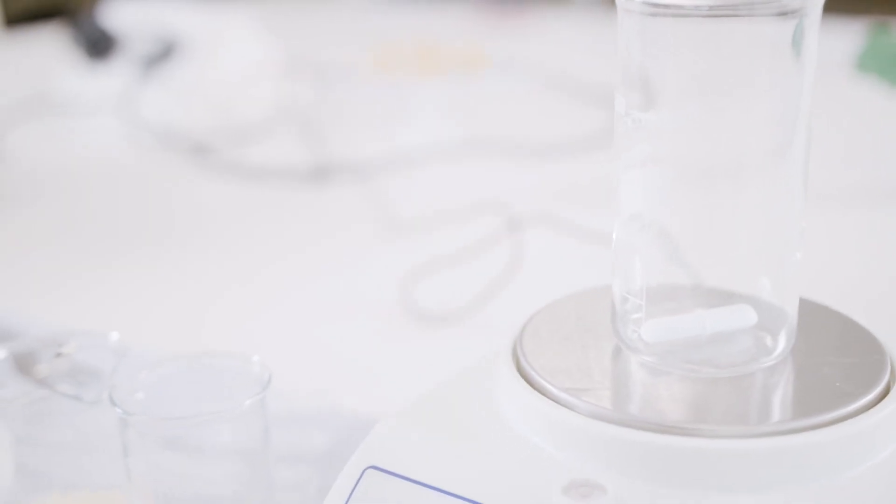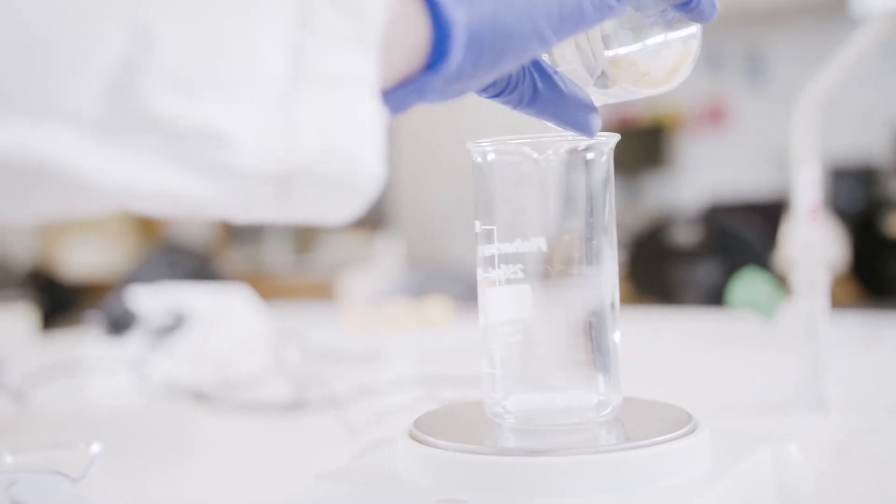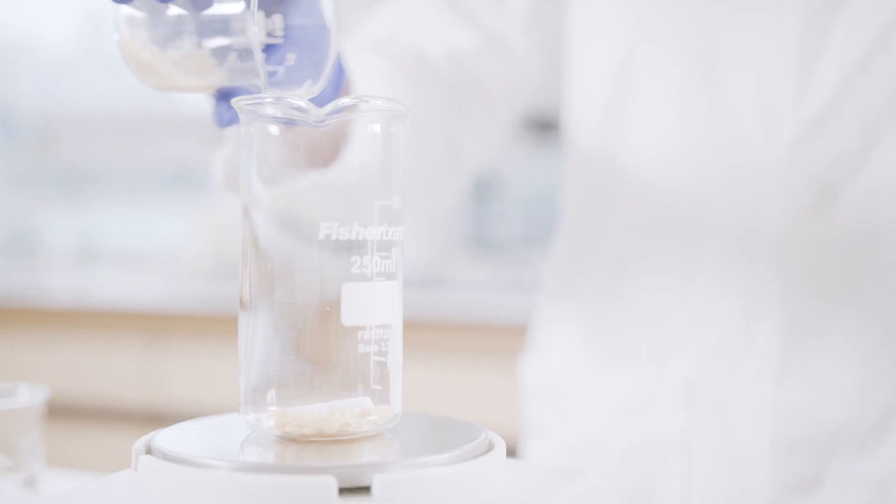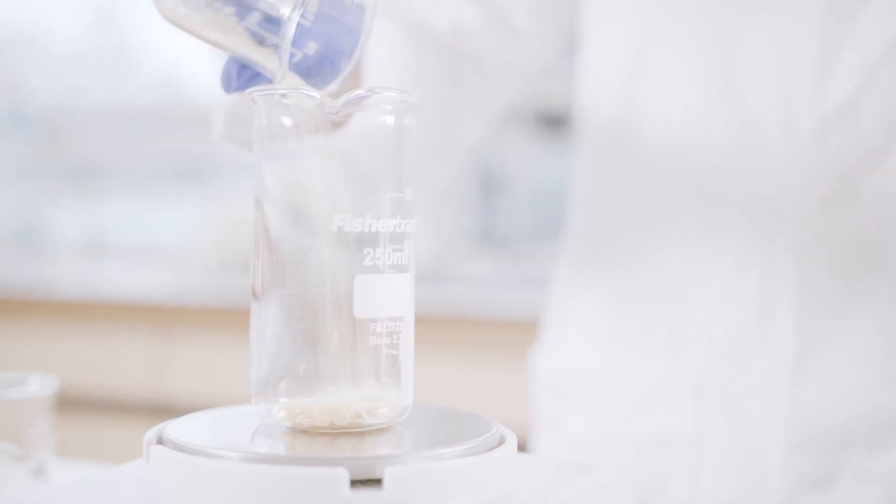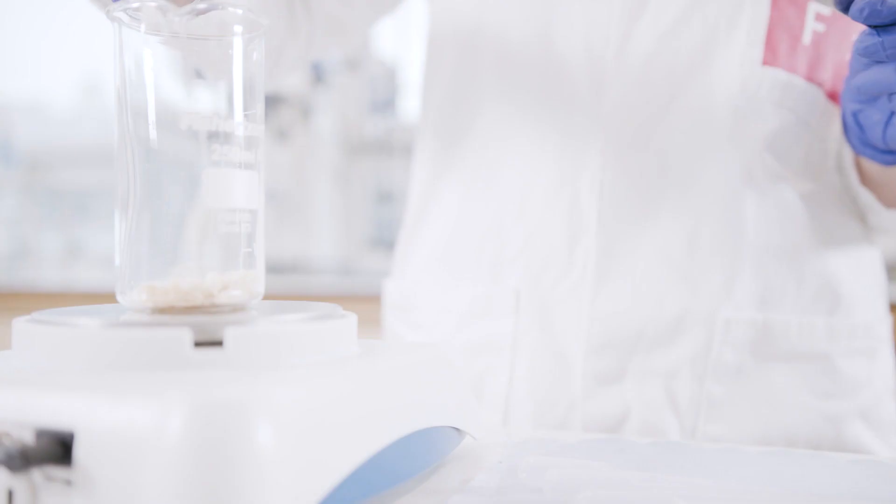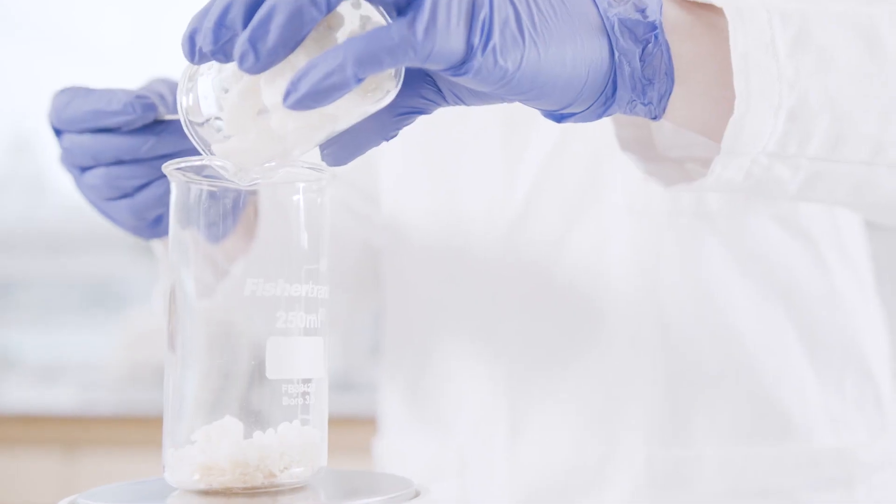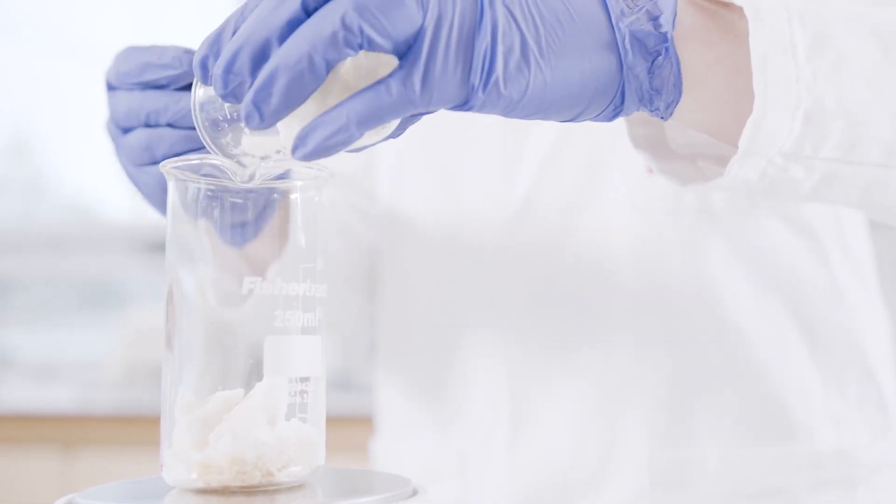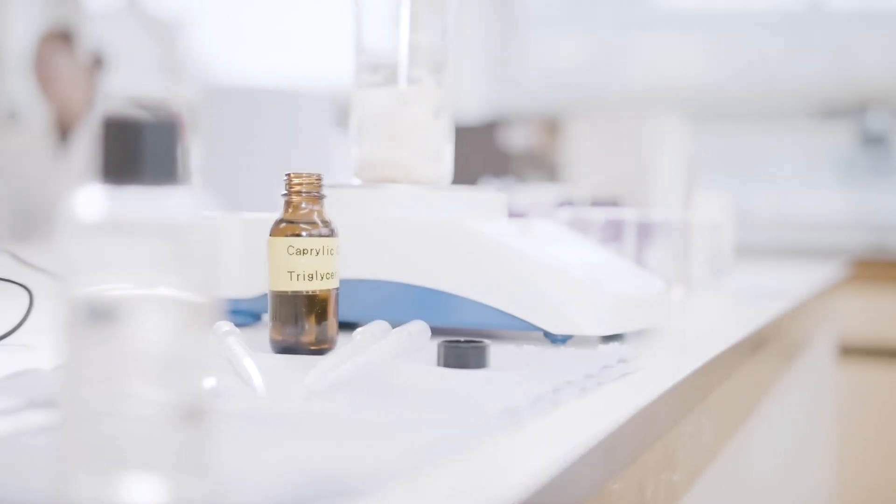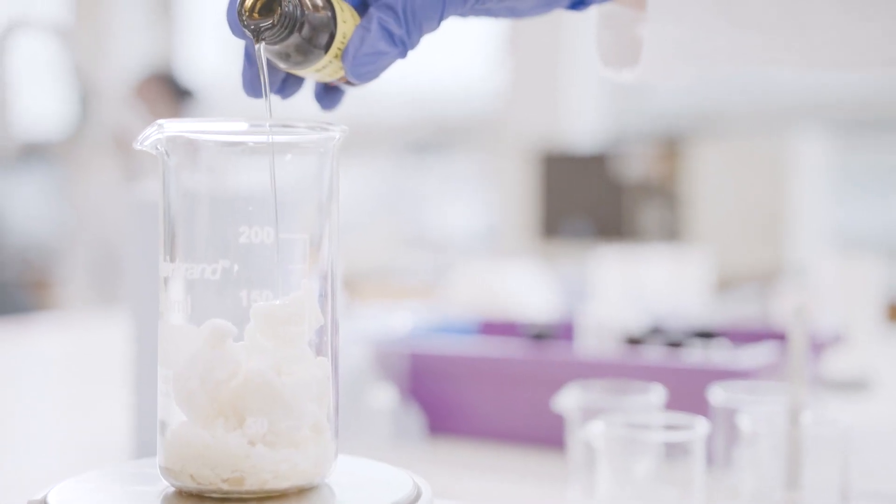We cancel out the weight of our beaker on the balance and then we add our least sticky materials, so candelilla wax, then the carnauba, then the beeswax, then the shea butter. Then we add our oil, so we add capric caprylic triglyceride and castor oil.